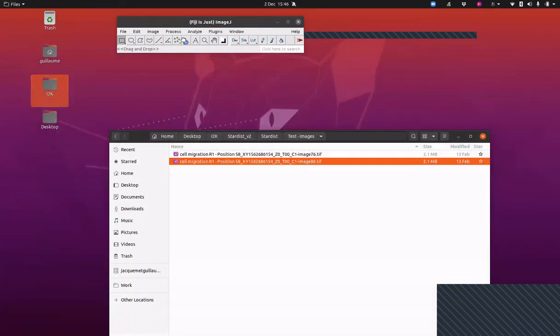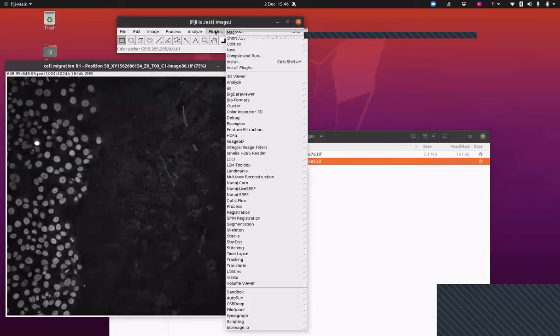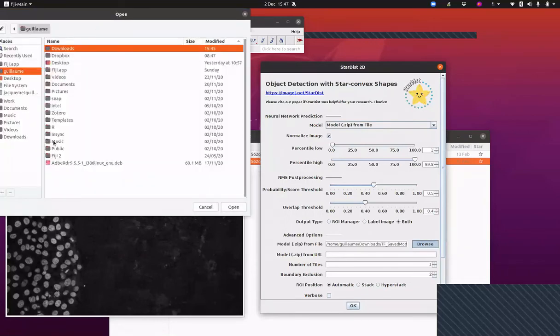I'm sorry, Guillaume, can you go over once? I was busy muting my screen and I didn't put the right. Of course. I used the zip that was downloaded, but I got an exception. So you can go to model from zip file, and then here in browse, you will need to find it.